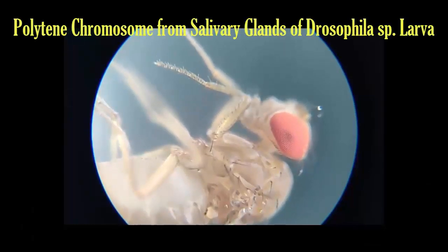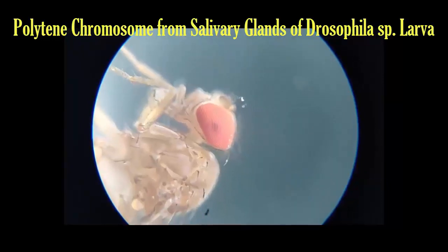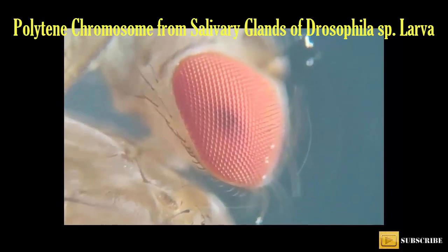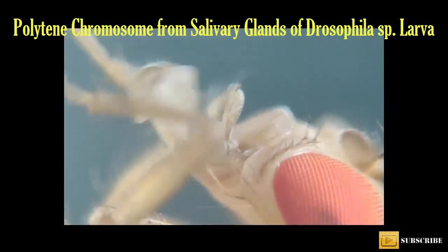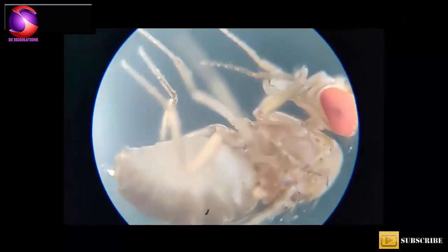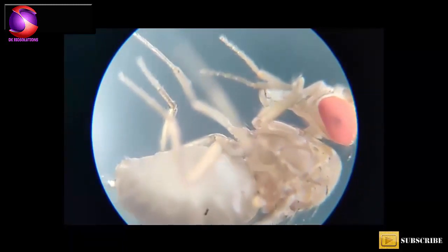In this video, we are going to learn about preparation and identification of salivary gland chromosomes. For this practical, we are going to use Drosophila larvae. To get good results, you have to follow the complete procedure as shown in the video. Watch the video till the end and do not skip any part so that you will get nicely stained polytene chromosomes.